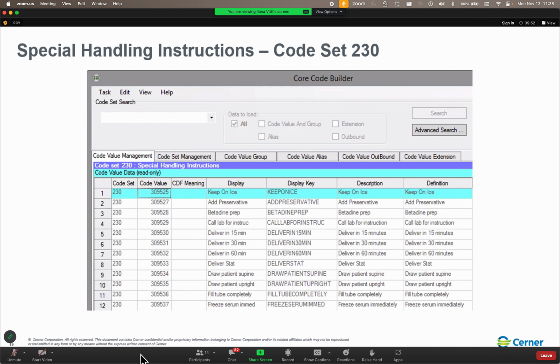Now, a group flag of N is no. I am not going to join you. You are not going to join me. So just think of it as our misanthrope, all right? It is antisocial. So for the add-on collection priority orders, if they immediately get an accession number, which they're an accession add-on, so they probably should, they're not going to pull any orders in with them.